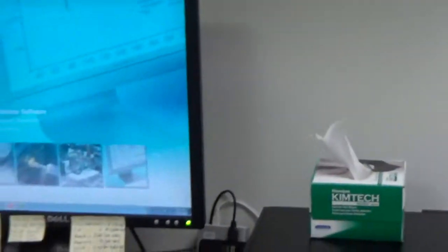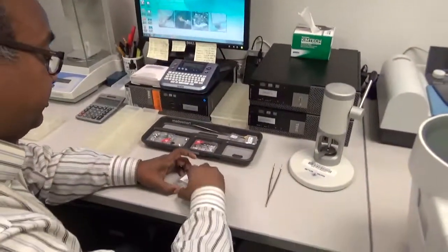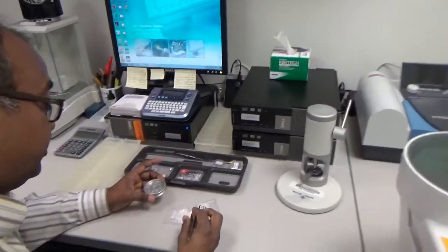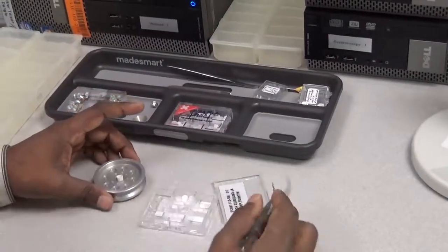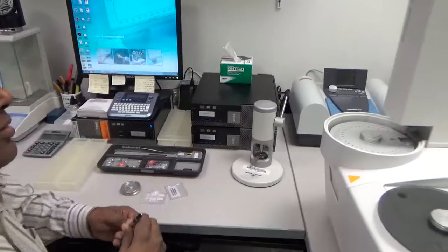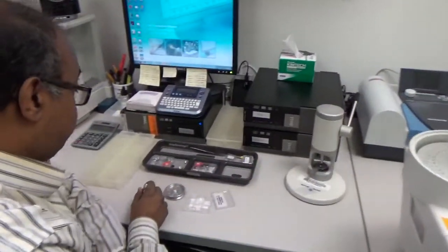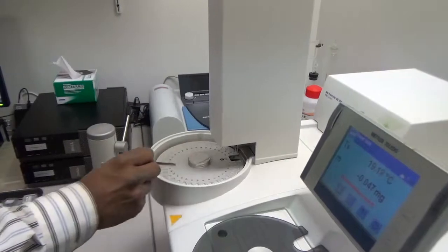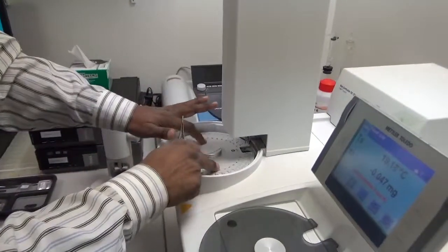To run a sample, first we load an alumina crucible — we take an alumina crucible and first load the empty crucible inside. There is one sample from the last run we did; we remove that sample. As I said, there are 34 positions, going from position 1, which is 101, up to 134. This sample tray stays there and can be removed.